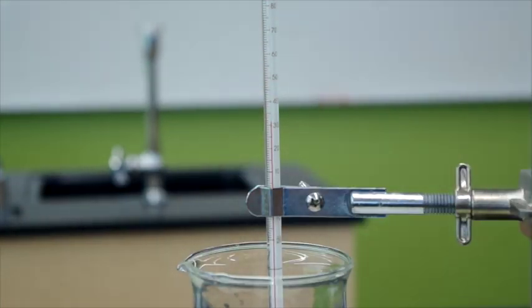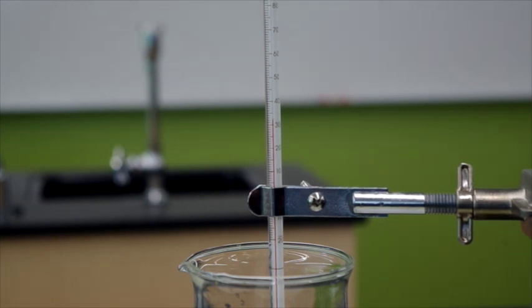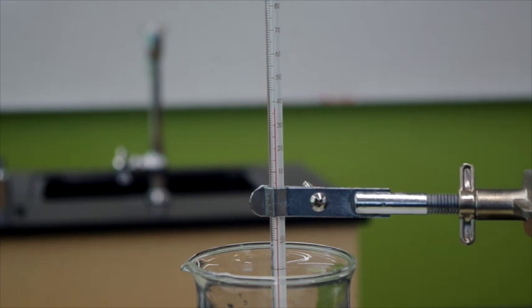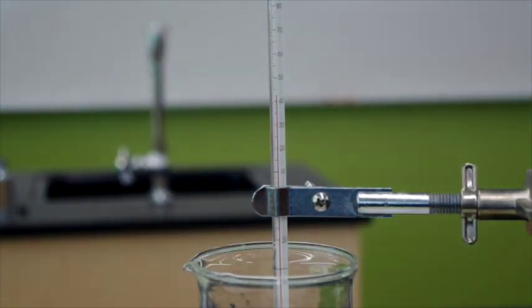It's 2 minutes. Temperature is 33. Wow, it's climbing. 43.